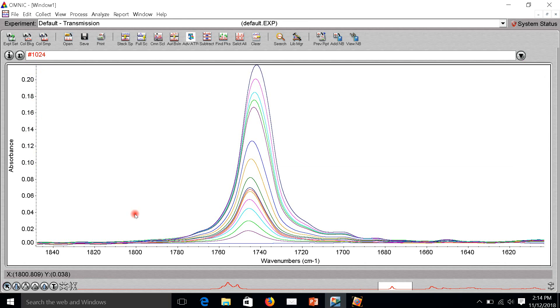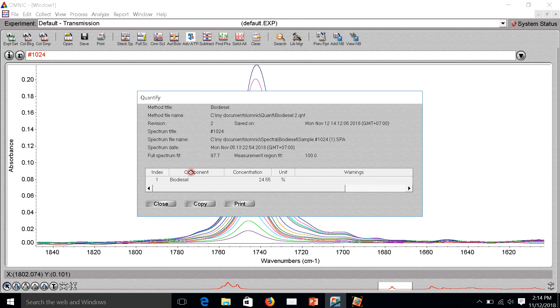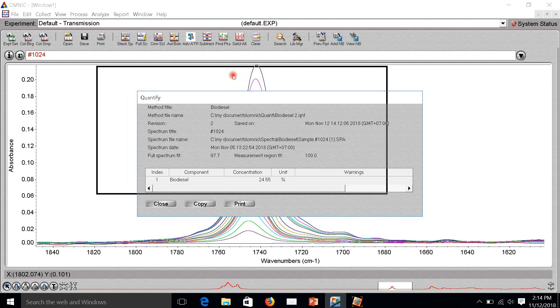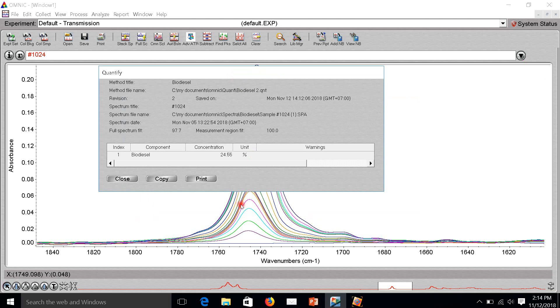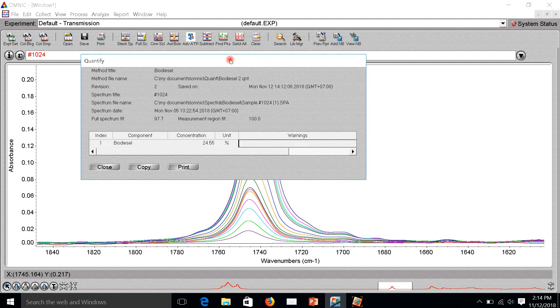This one is the concentration of biodiesel. Here is full spectrum fit. It means the spectrum is very similar with the calibration curve spectrum, so nothing warning here. All good, I think.